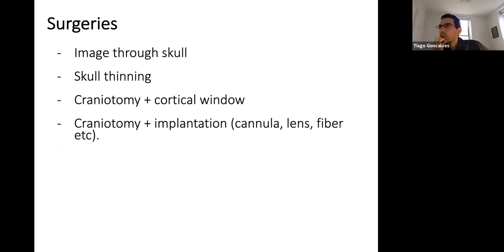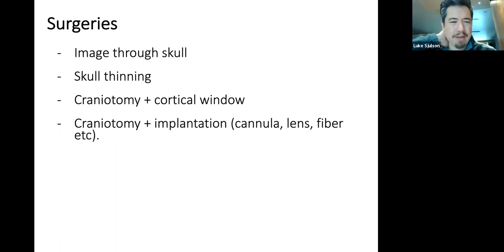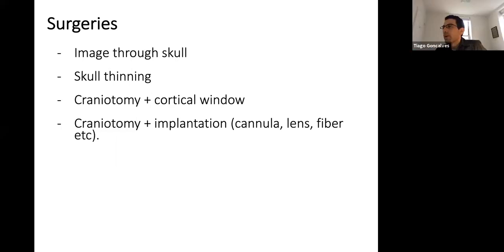Yeah, it's much longer. What is that time? There are different GCaMPs. I don't know what the fastest one is. The slowest one, GCaMP6s or 7s, is like 150 or something. Tiago, do you know? I don't remember. I actually have a slide with that toward the end that I'll probably not get to.